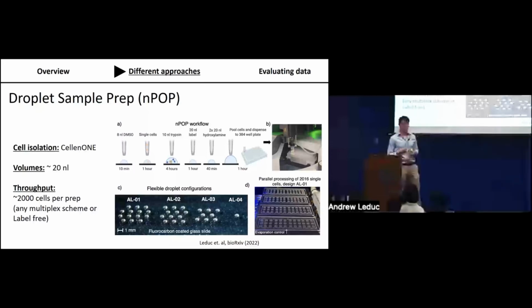If you don't impute and minimally process the data, and for a PCA you compute correlations on a pairwise basis, we're still, for the most part, able to see as one of the main sources of variance the difference between these two cell types, which are quite different. Hopefully you would be able to easily extract that trend.